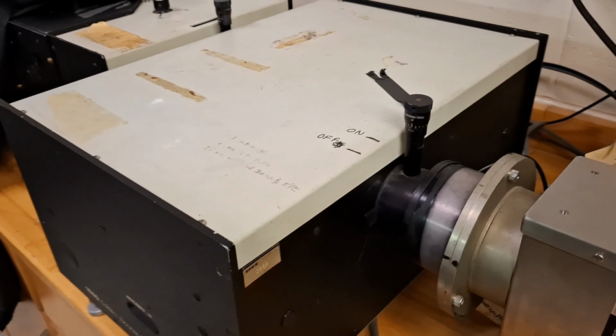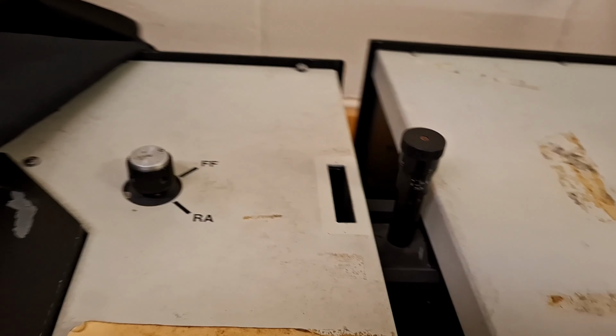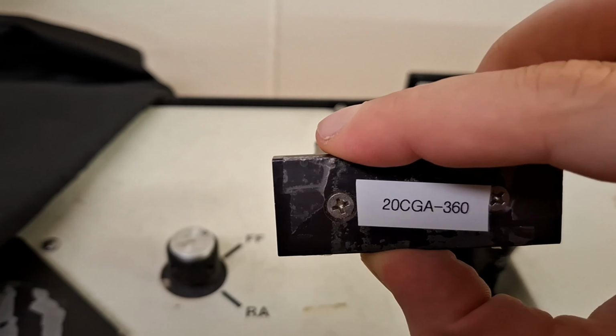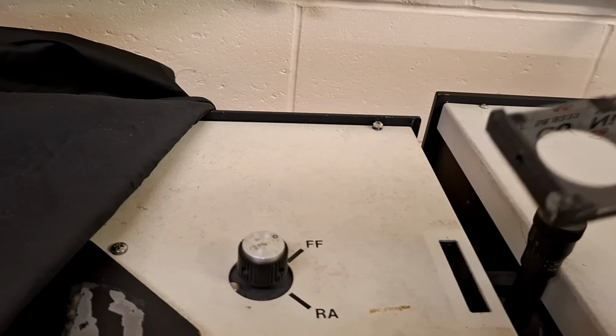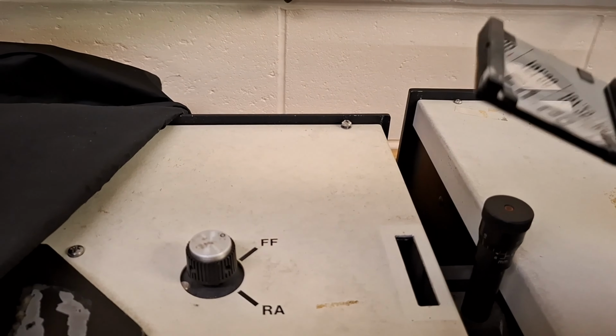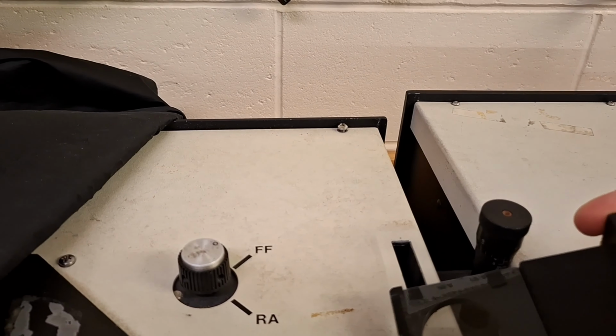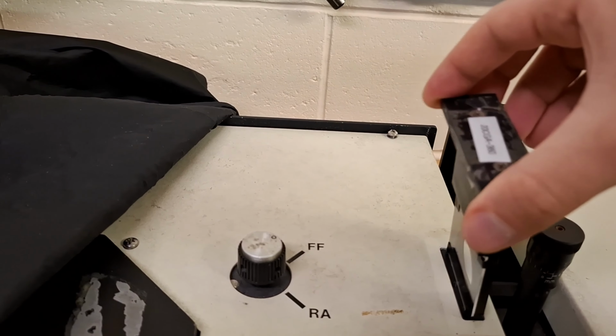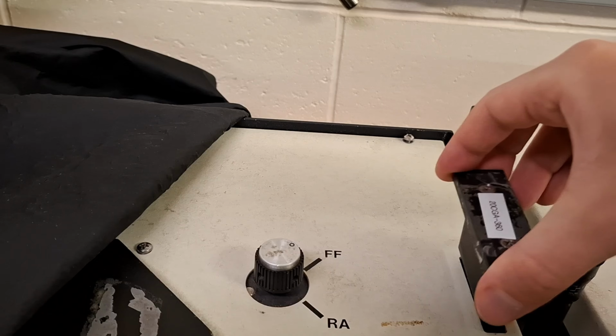And I will put my filter here. This is a 360 nanometer long pass filter, which means that any light shorter than 360 nanometer will not go to the emission spectrometer or the detector.